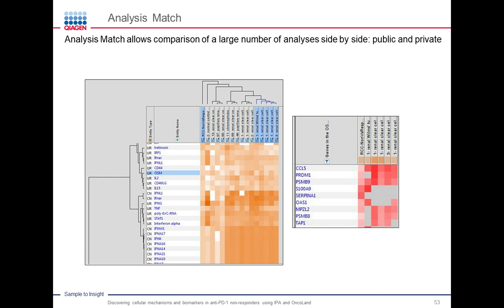But now you're wondering why OSM is turned on. You can also generate another heat map in IPA, which I'm showing you on the right-hand side. The gene heat map on the right-hand side is the gene expression heat map, and this gene expression heat map shows why OSM is on, because many of the downstream factors of OSM are also upregulated, and that's why OSM is on. So this is a very important distinction.